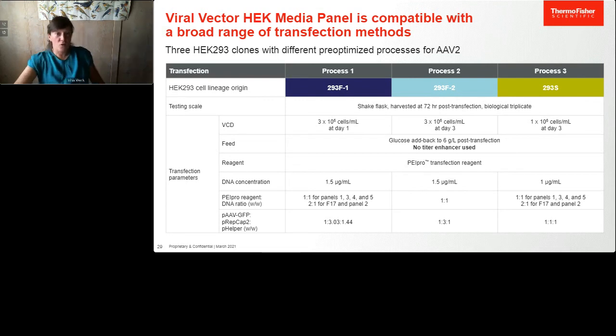It's also important to underline here, we looked at the effect of basal complex media only. We really wanted to see the effect of this single parameter on the cell line productivity. So in none of the experiments were we using small molecule addition as titer enhancers.